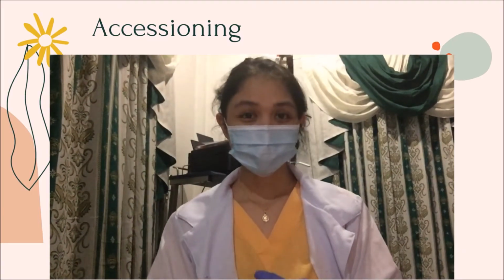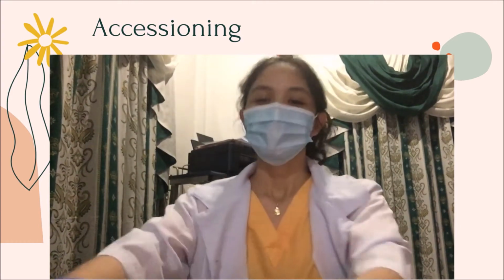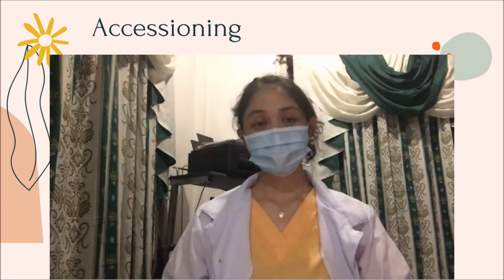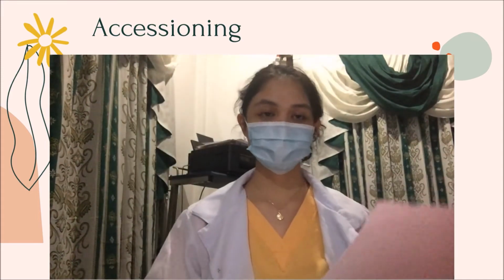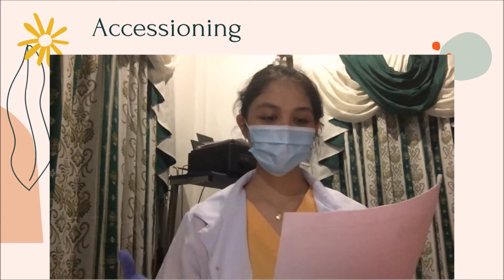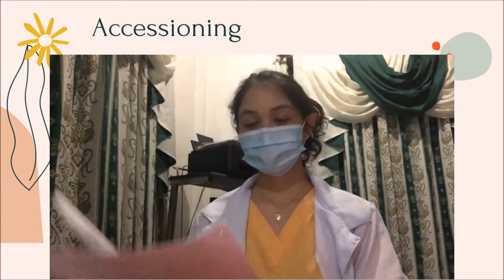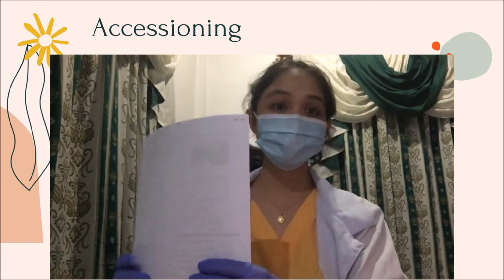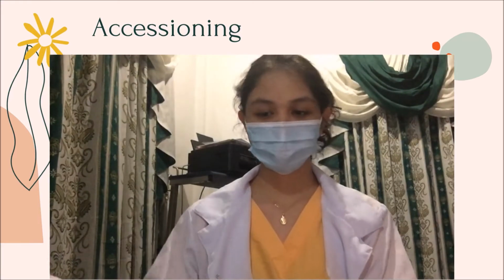Okay, so now that we're done with documentation, we're gonna go through specimen accessioning. So in accessioning, we're gonna be needing all the relevant documents like the request form that has the patient information, patient history, and the description and the site of origin. Also, we're gonna be needing the receipt of transaction and any other pertinent documents that is completely necessary.